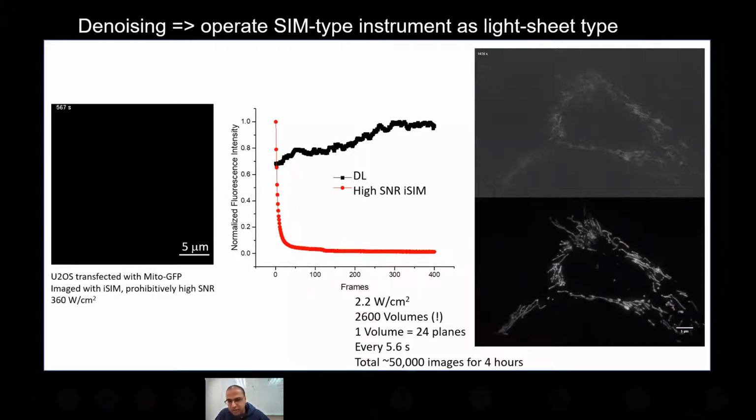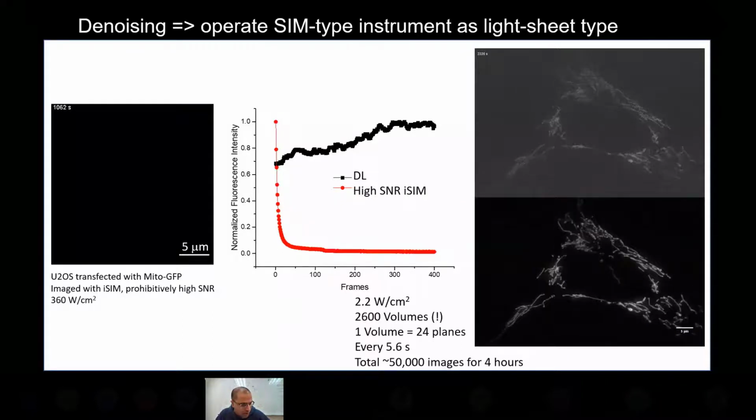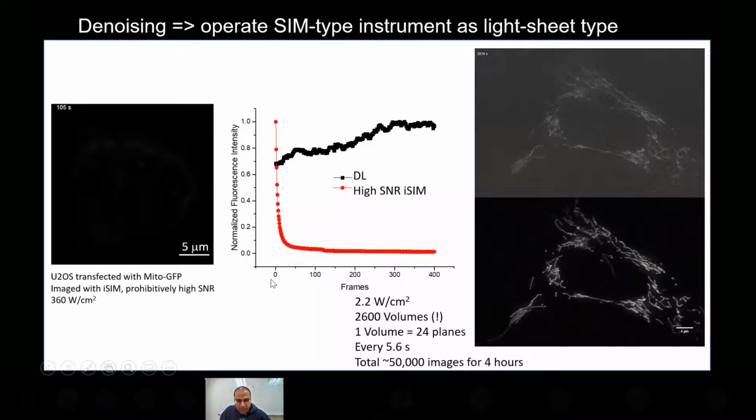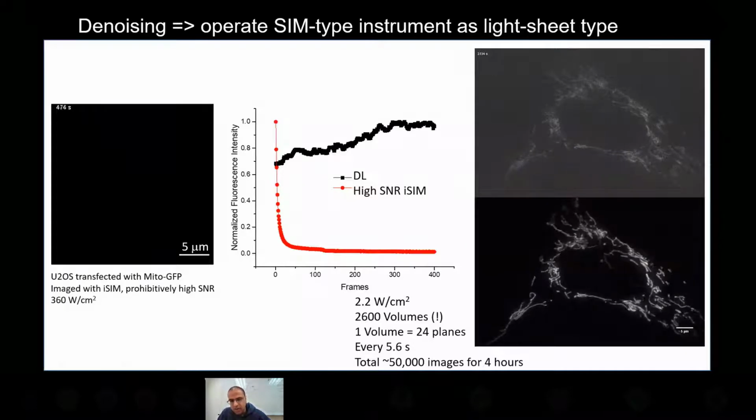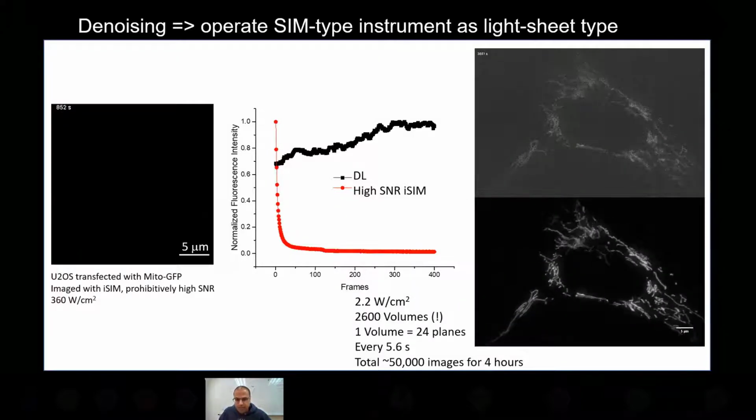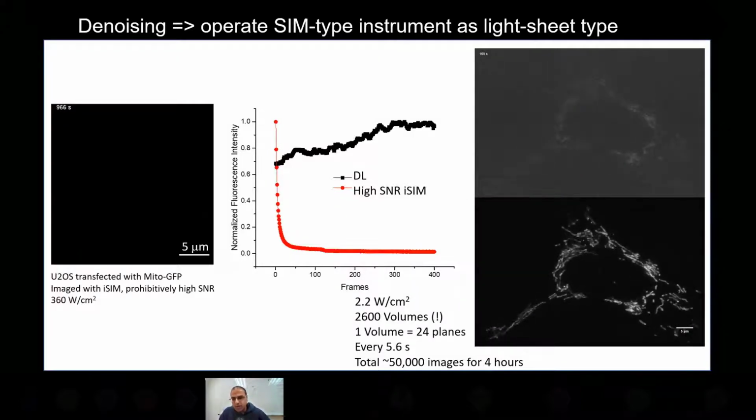And one of my colleagues, Phil Lassou, also did a quick look and also didn't find any significant mitochondrial fragmentation in the restored data set. So, to me as an instrument developer, this was kind of amazing, right? I mean, for once, the fluorescence signal actually rose over time, which is something we never saw with these super resolution modalities. But the restoration could give us data we couldn't actually obtain with the base microscope. And this sort of held in other examples.